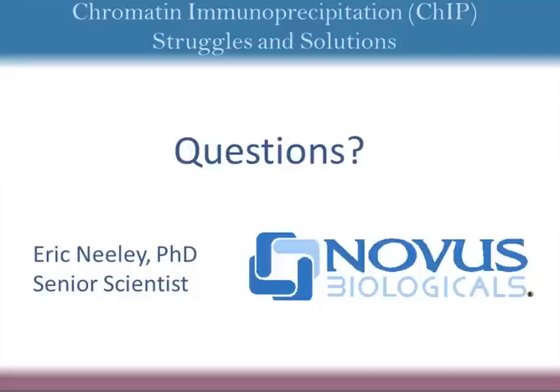That's a good question, and that's one thing I wonder myself. There's a lot of difference in beads when you're just looking at their properties. Some are what's called paramagnetic, where they don't retain any of their magnetic abilities afterwards, and some are just regular magnetic beads. They have different coatings on them, so these were all protein G or protein A and G coated. So it could be that the protein A or protein G that they're using to coat the beads just isn't working as well or isn't coated as well.